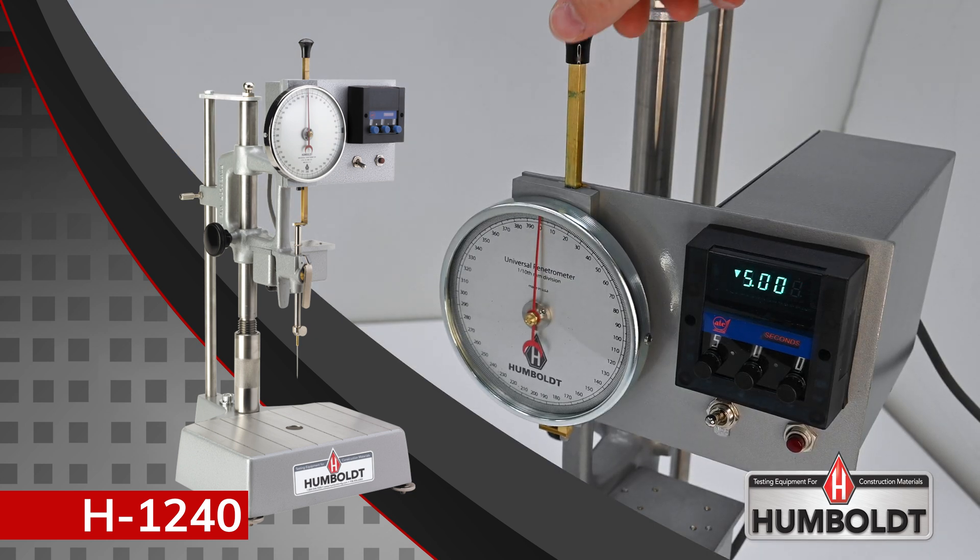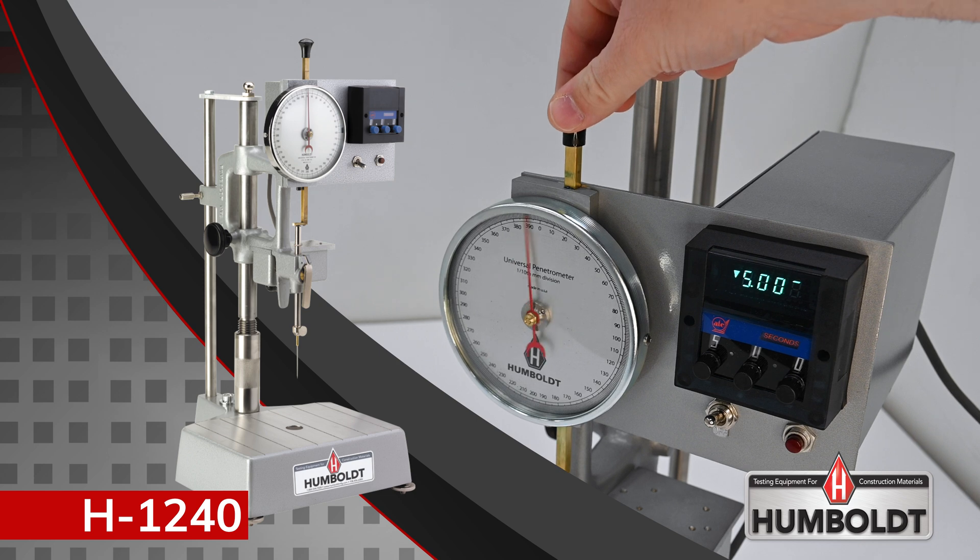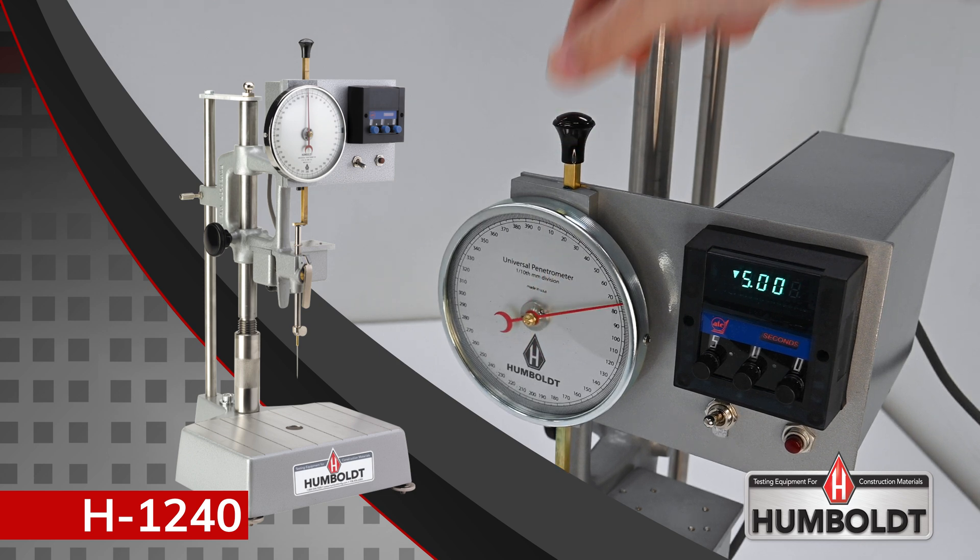They also feature Humboldt's calibrated friction-free plunger mechanism, which provides instant responses and ensures smooth free fall of the needle.